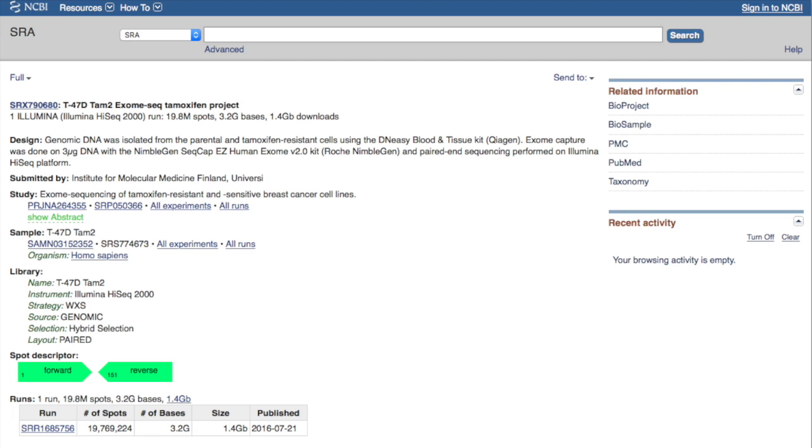To me, it's even something new, but there's a tool called Aspera Connect. Aspera, yeah. And when I tried that, it was much faster than the SRA toolkit. And you don't need to use the command line, so that was what I was going to recommend to folks.